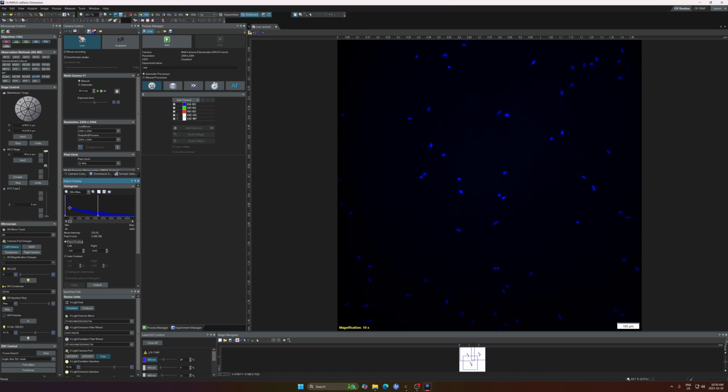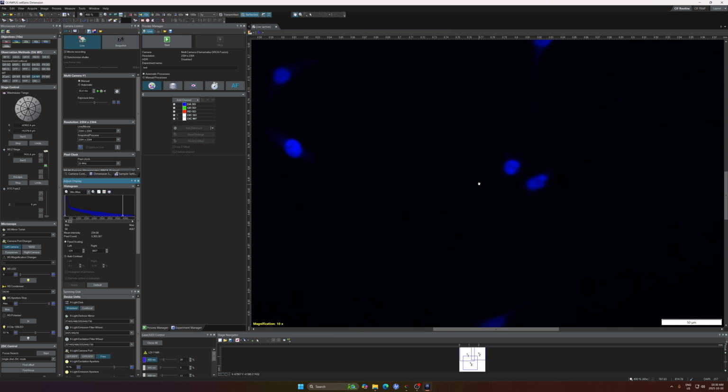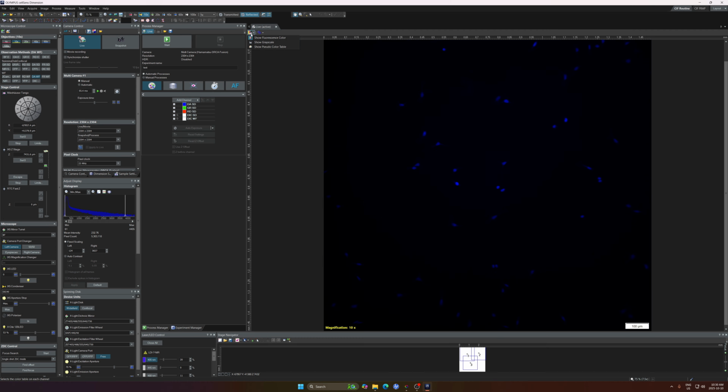Using the logarithmic scale for your histogram makes it easier to appreciate the distribution of the intensities than the linear scale. You can further inspect the image by zooming in and out and potentially changing to a more favorable lookup table.